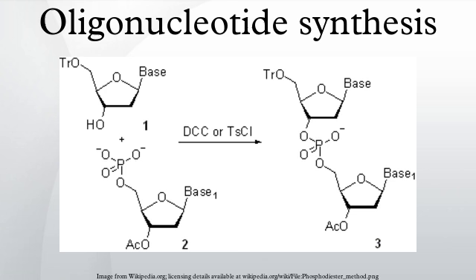A very short selection of commercial phosphoramidite reagents is shown in the scheme for the demonstration of the available structural and functional diversity. These reagents serve for the attachment of 5'-terminal phosphate, NH2, SH, aldehyde, and carboxylic groups, C≡C triple bonds, non-radioactive labels and quenchers, hydrophilic and hydrophobic modifiers, and biotin amidite 11.